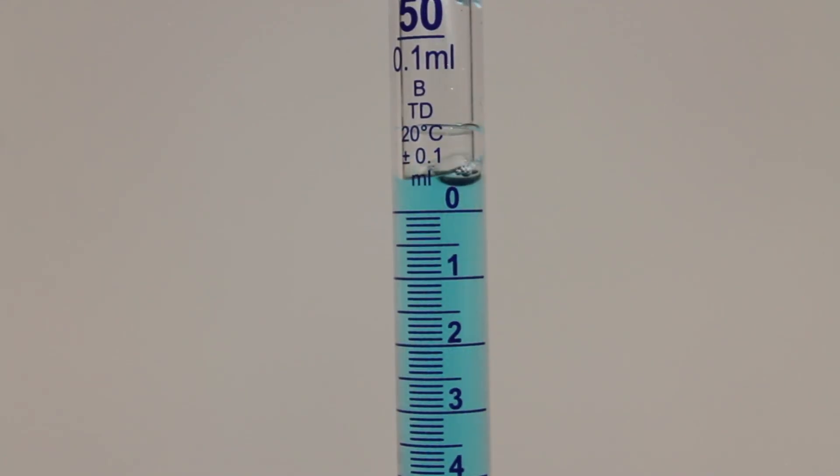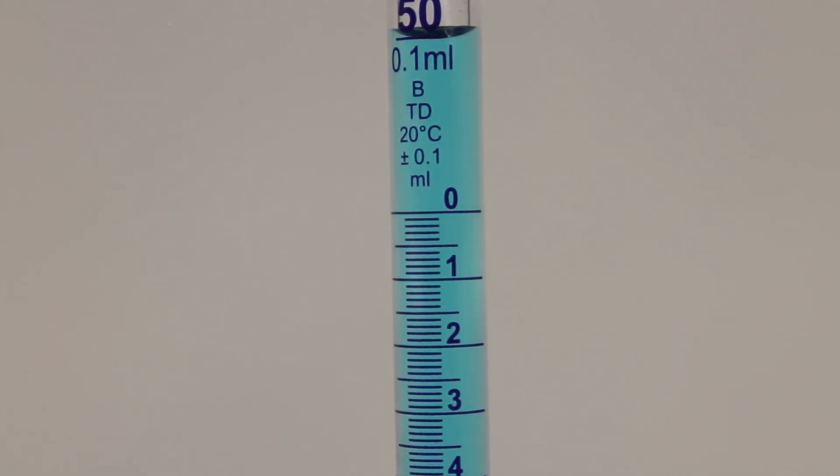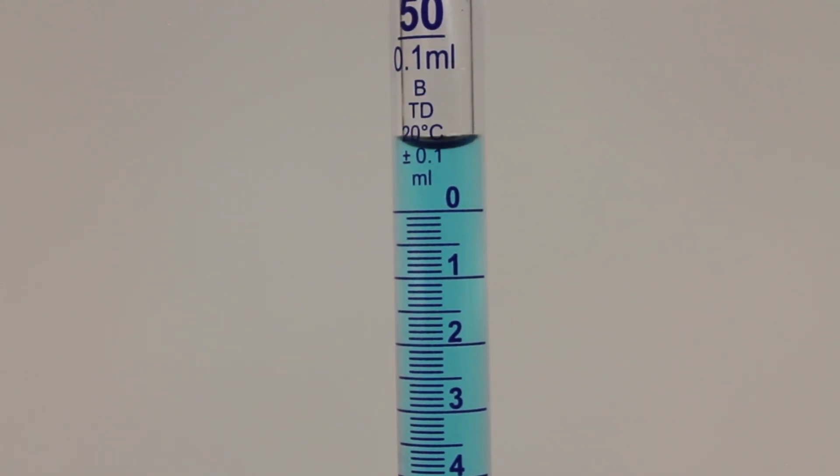Now fill your burette to your desired initial volume. I like to fill mine up past the zero mark then run the burette down to my initial mark at zero. Once you have recorded the initial volume you are ready to use your burette.